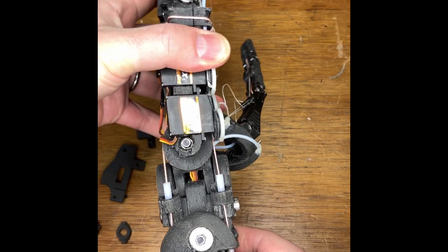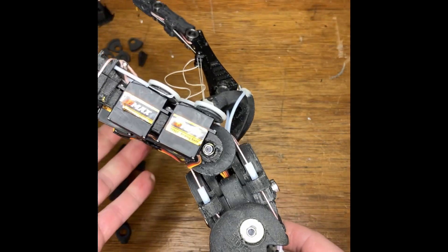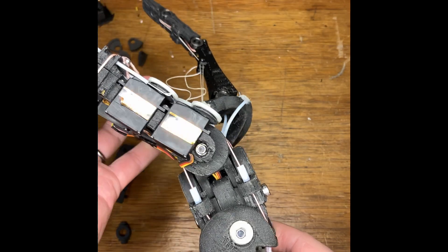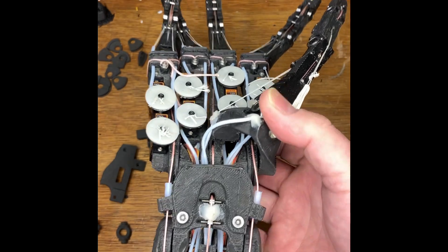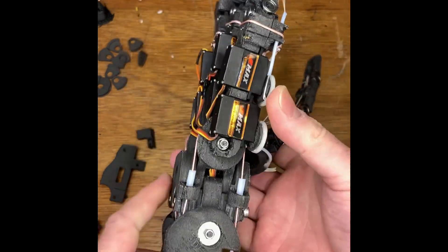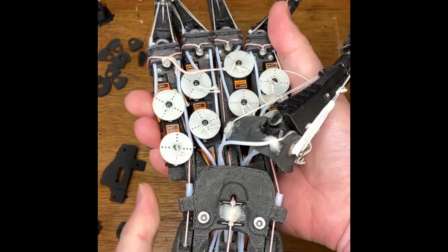It's not perfect — there's a bit of free play — but that doesn't matter yet. We'll see as we get more precise and try to repeat actions whether that has an impact. Anyway, that's the wrist figure-eight central yaw constraint.